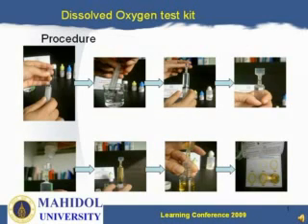Step 1. Suck 10 ml of water sample using a syringe connected with a little cup and plastic tube. Step 2. Release the water sample a little bit in the little cup. Add 1 drop of DO1 reagent. Then block the hole on the tip of the syringe with a plastic rod. Shake 3 times. Step 3. Unblock the hole of the tip of the syringe.